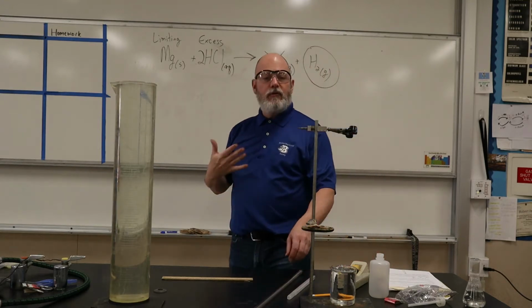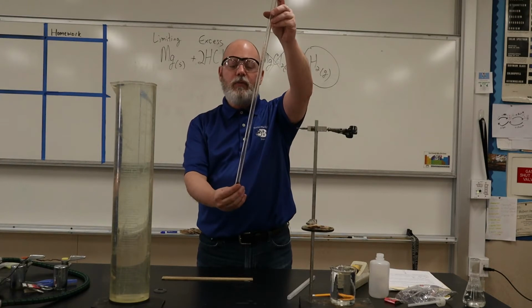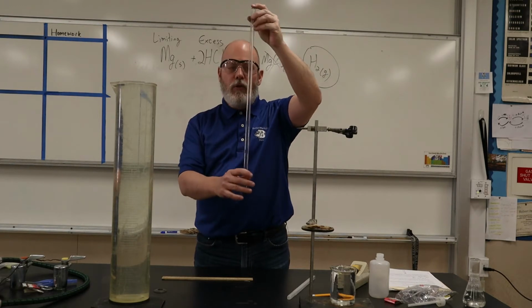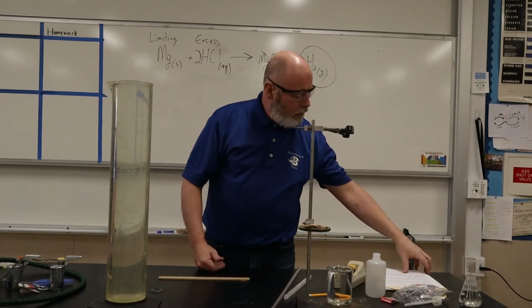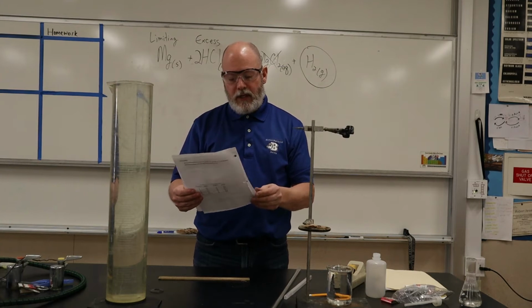Now, how do you collect hydrogen gas? You're going to use a gas collection tube, also known as a eudiometer. We're going to show you how to do it. The first step is to set up.